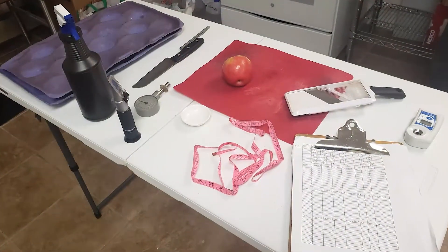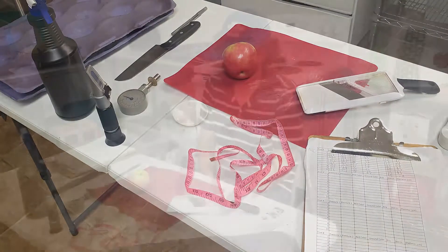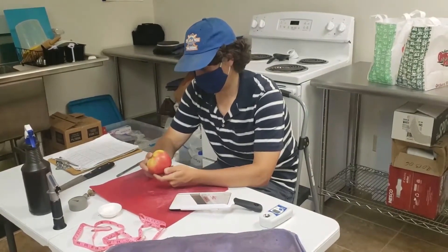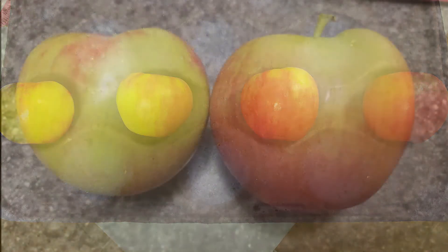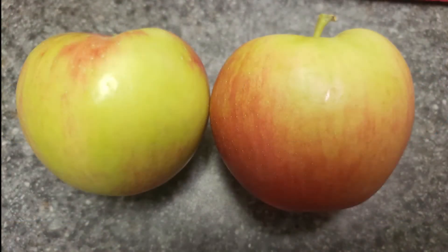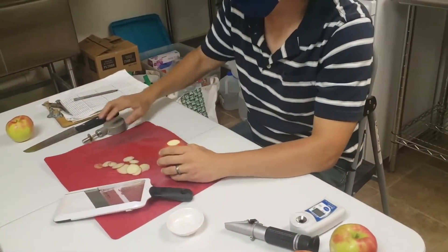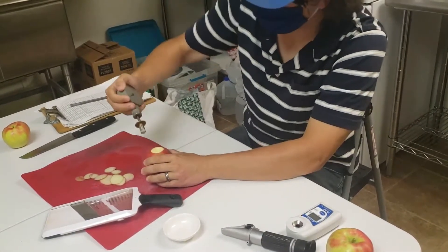Apples should be tested within 24 hours of when they were sampled to get the most accurate results. Once you have your samples, the first test we would recommend performing is a color rating. Record the percentage of red color development on each fruit. You should also record the background or ground color, as this can be a helpful maturity indicator for a number of varieties. Next, we will conduct a firmness test.